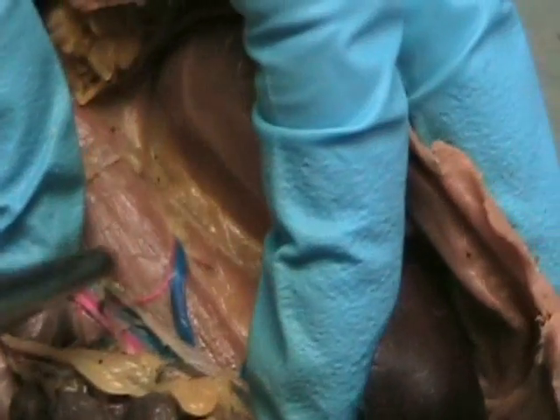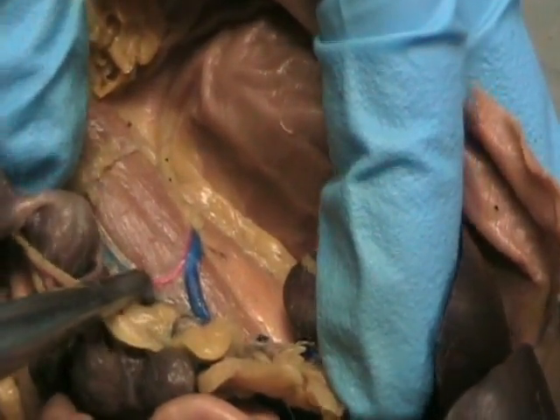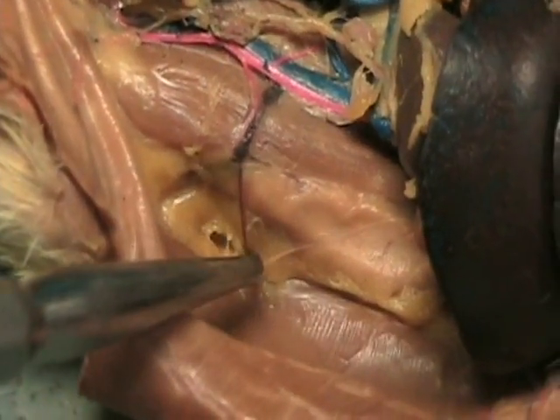Alright, so next on down, after the gonadal arteries, we're going to have these going to the sides, and they don't look like they really go anywhere. They just kind of disappear. Right here. They just go to the beds of fat. Those are the circumflex iliac arteries. Let's look at the other one. There's the circumflex iliac artery there. Hey, it just disappears into the bed of fat.